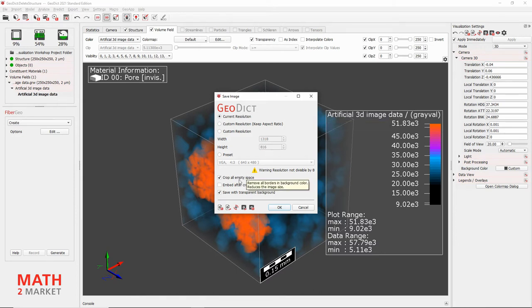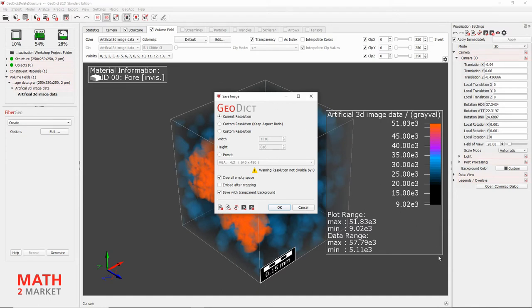Next up is the option to Crop All Empty Space. After the image is captured, it will crop all the background space around the image — adjusting the top, bottom, left, and right borders to remove the gray background pixels. Because we have a material legend and XYZ axes, it will crop up to the corners of the material legend. If we were to disable those legends and just keep the cube, it would crop right to the cube. There is also the option to save the image with a transparent background, which is useful if you embed it in PowerPoint slides.